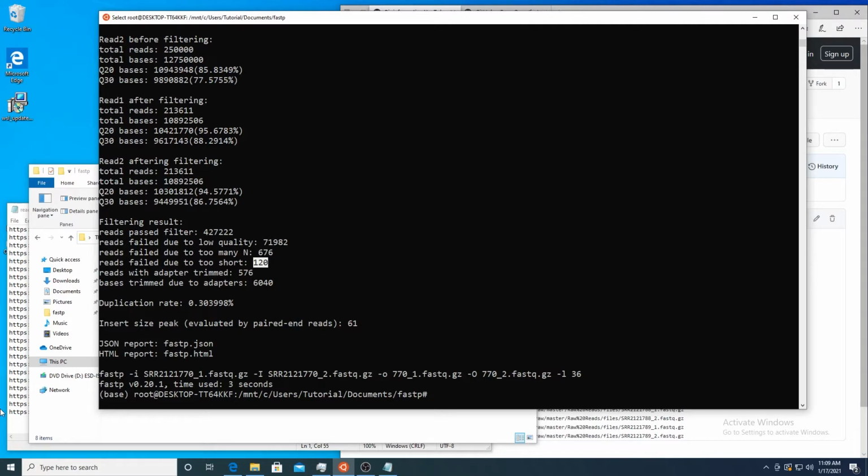Something that is also useful from fastp is adapter trimming, which happens automatically in fastp with, I think, just forward end or single end reads. It's really nice compared to Trim-O-Matic, where you have to specify where the adapter file is and all the different things that go along with the adapter. So it's way more handy with fastp. Usually there's no harm in running the adapter trimming whether or not any adapters are identified in a program like FastQC, so leaving it on here isn't too big of a deal.